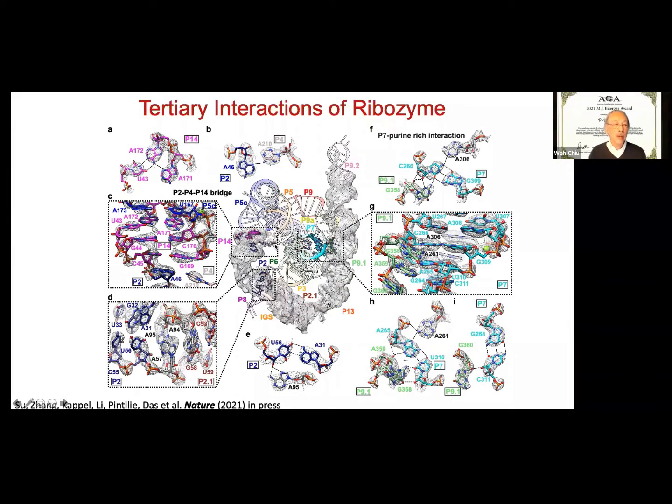The exciting aspect is that we see two almost orthogonal helices, two strands perpendicular to each other, that form the perimeter regions of this intact ribozyme molecule.